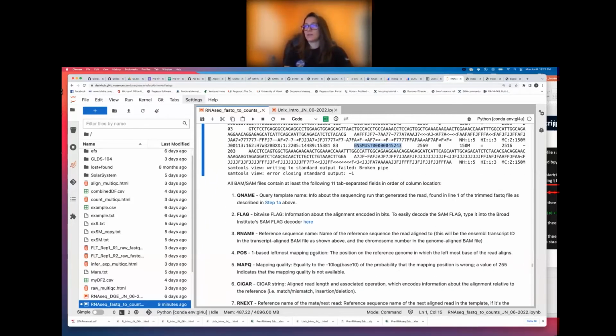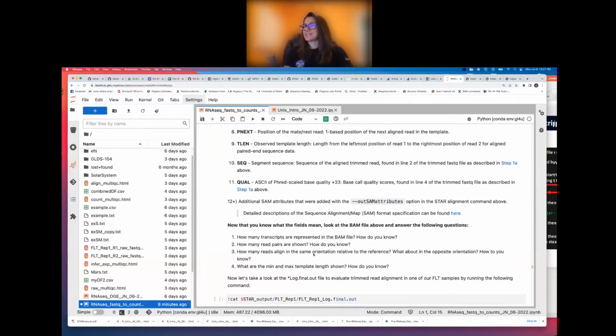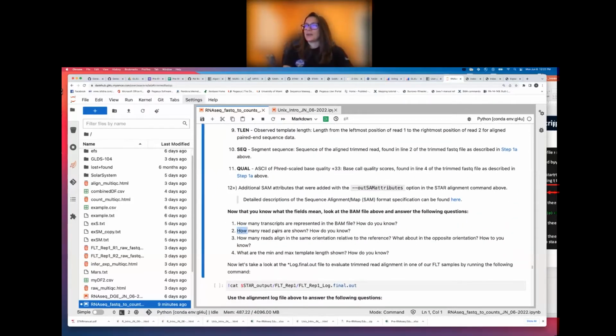Okay, great. So we're going to move on to the next question, which is how many read pairs are shown and how do you know? So I talked about this a little bit in the lecture. So you guys go ahead and answer that next question. How many read pairs are shown and how do you know?